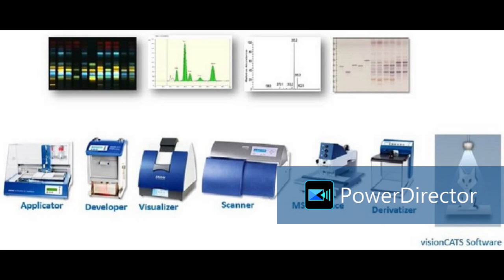This is our laboratory and these are all the content details. Thank you. And we have simulated one experiment. In albumin we have added a Good Night mosquito repellent. We will see how, in the spiked sample, we can detect it. Okay.